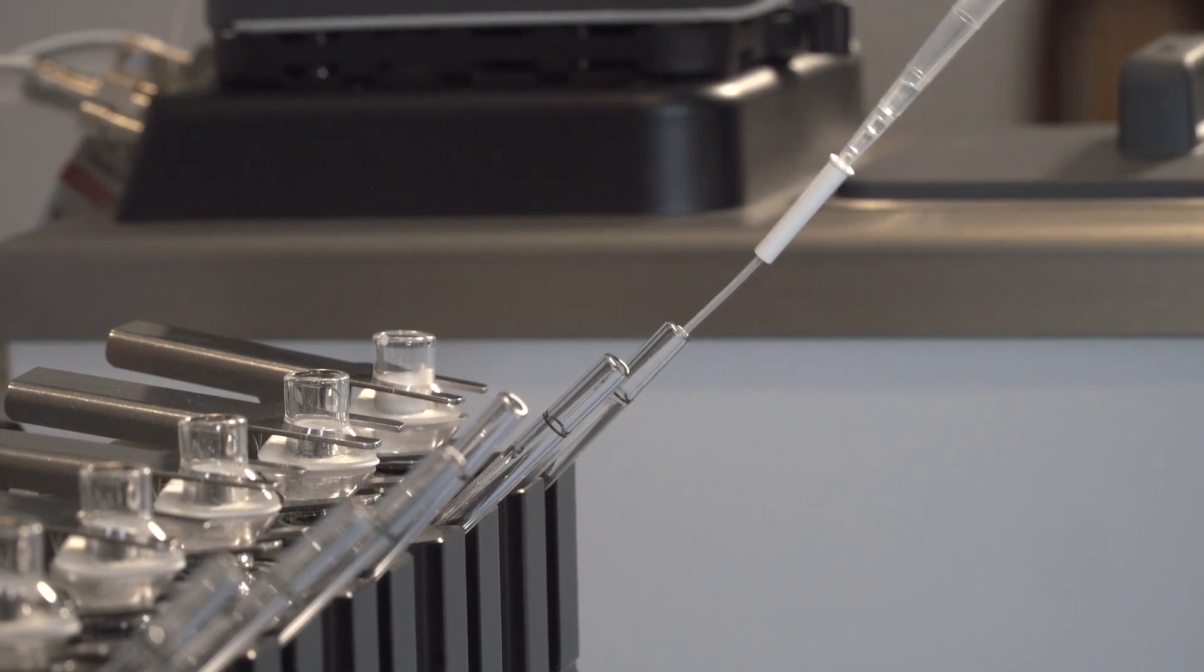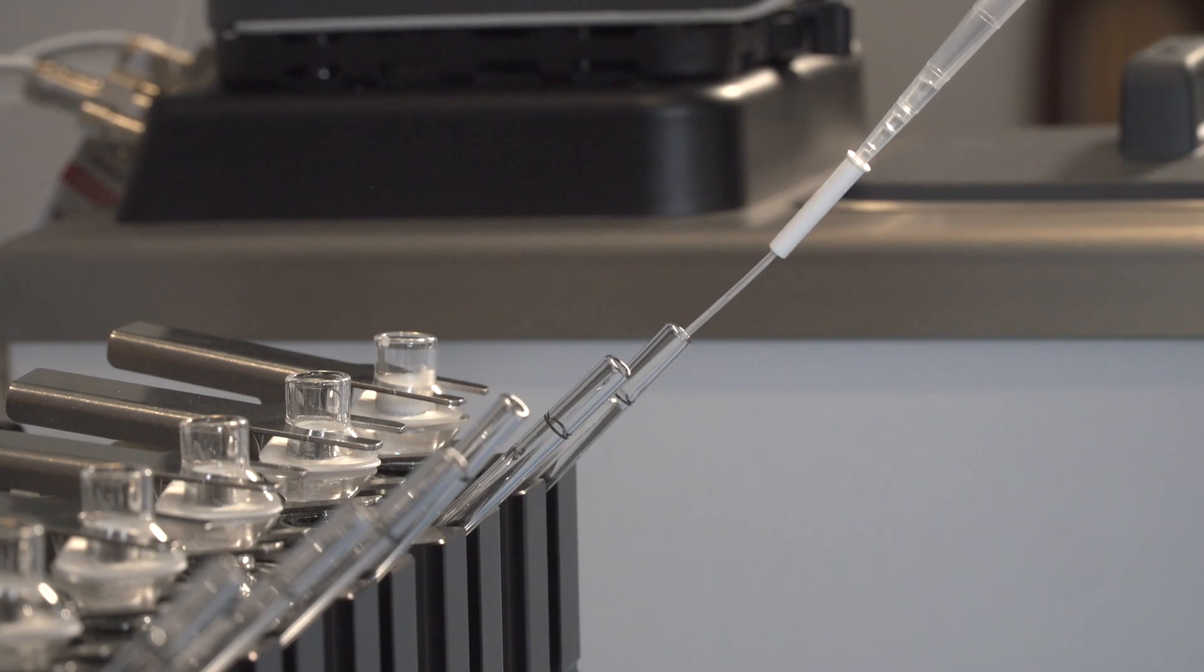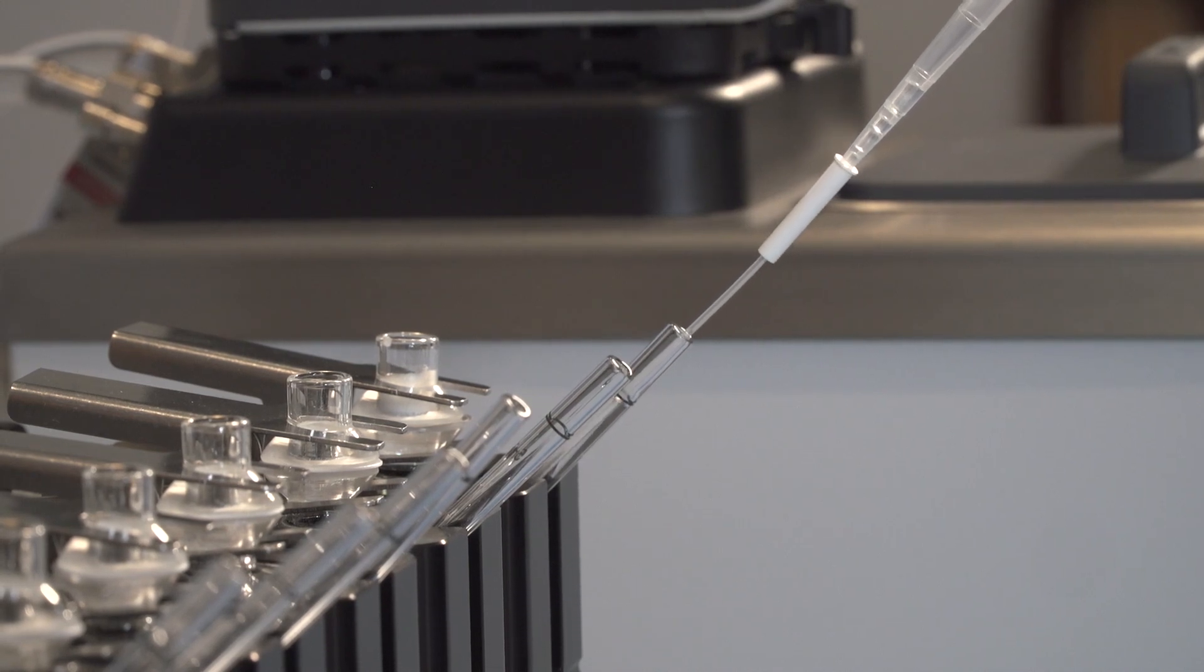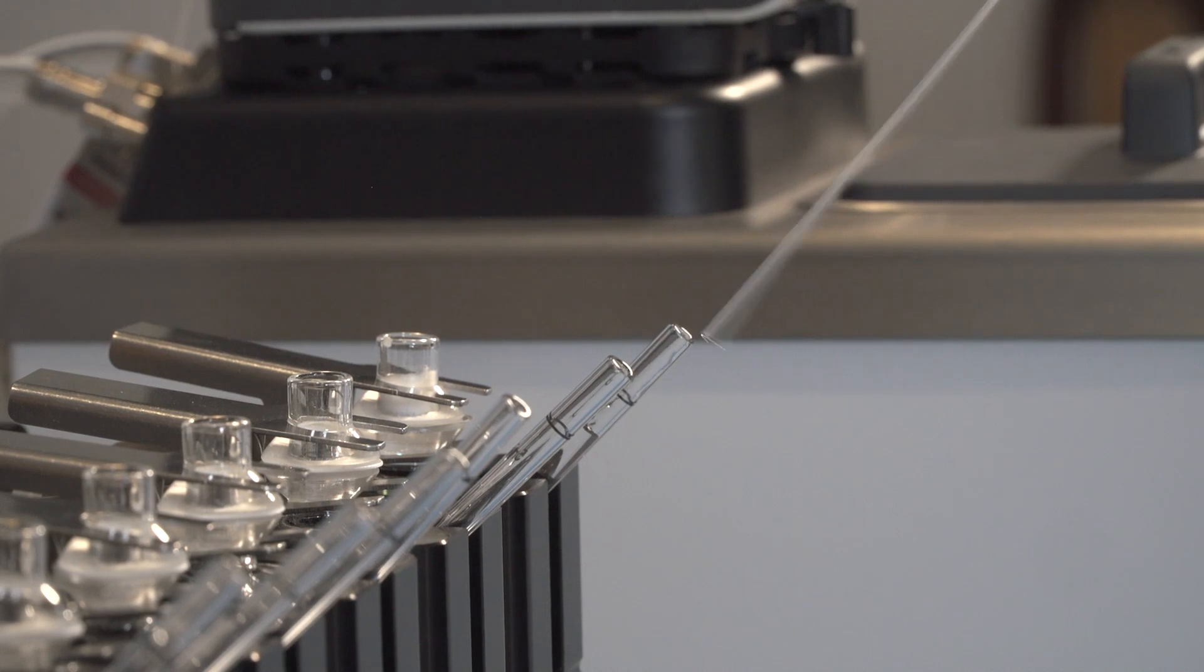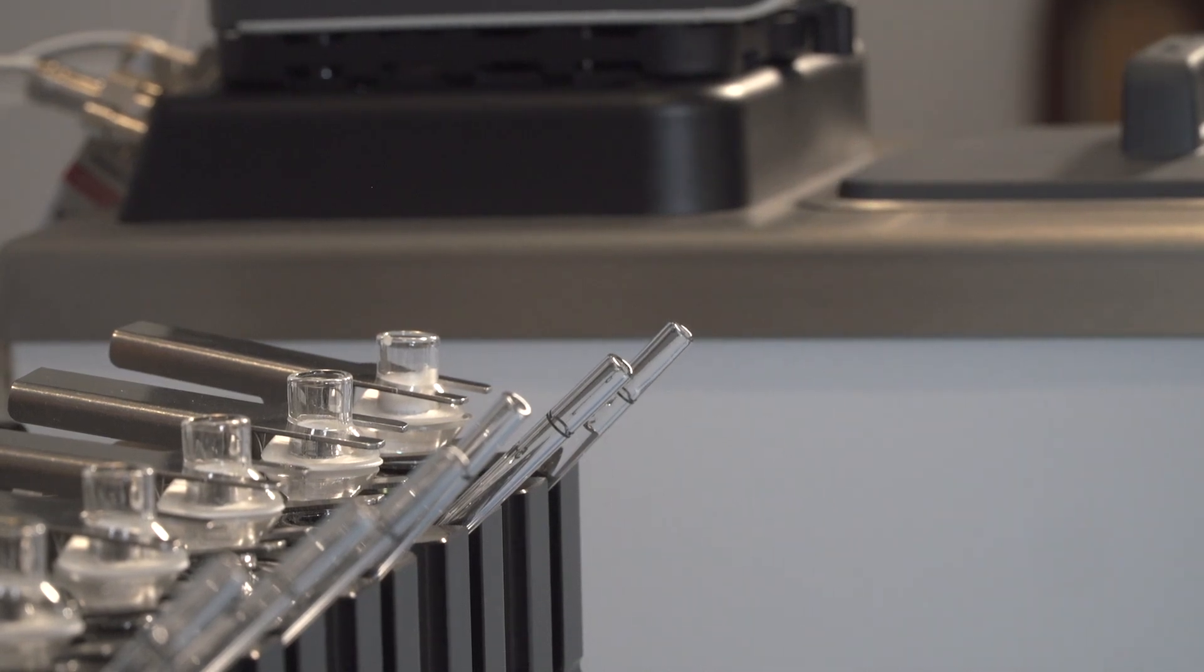Sampling must be performed from the center of the receptor chamber. Sampling can be performed with a pipetter using a PermeGear pipette tip, a syringe with a PermeGear syringe tip, needle, or thin cannula.